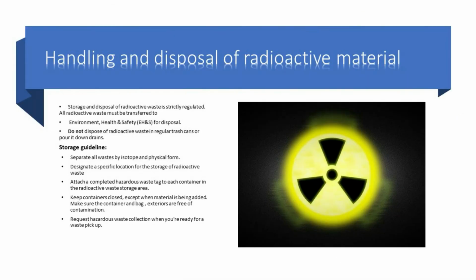Handling and disposal of radioactive material. Storage and disposal of radioactive waste is strictly regulated. All radioactive waste must be transferred to Environment, Health, and Safety for disposal. Do not dispose of radioactive waste in regular trash cans or pour it down drains.